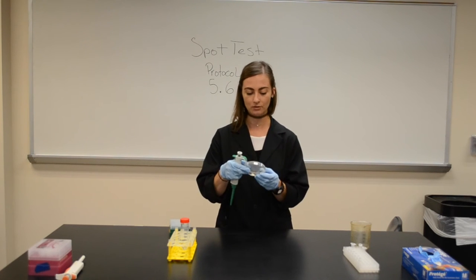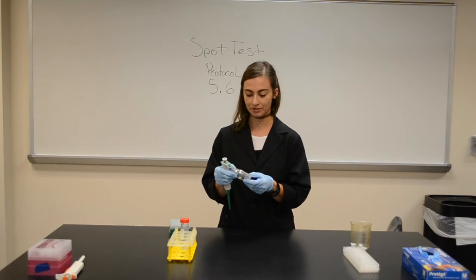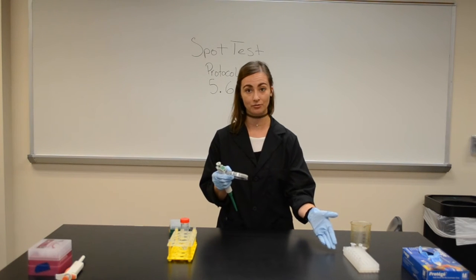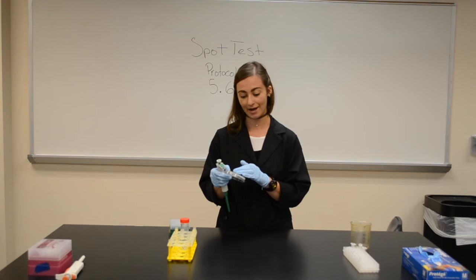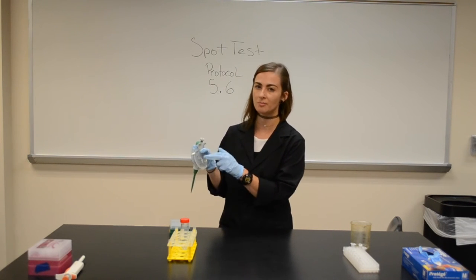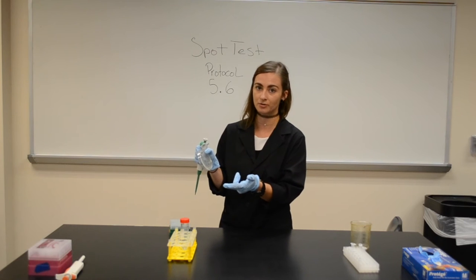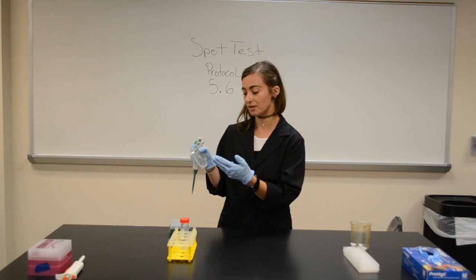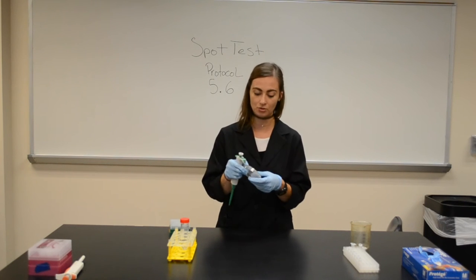For a spot plate, you would want to label — for example, since I am spotting my dilutions from earlier, I have my dilutions labeled out. I have a little line to show me where that spot would be once I go to check this plate tomorrow. I have minus one through minus six labeled, and I have 'soil' written because I'm going to be doing a soil spot.